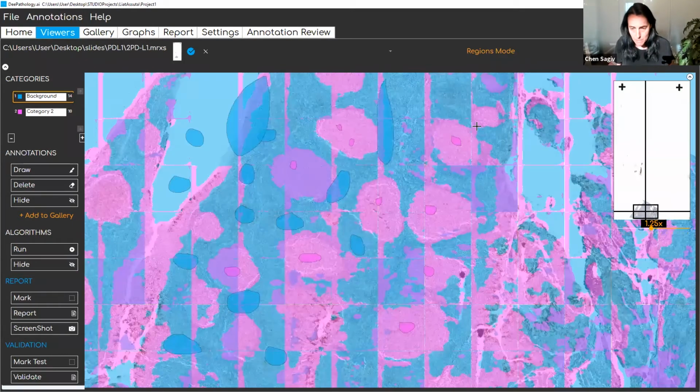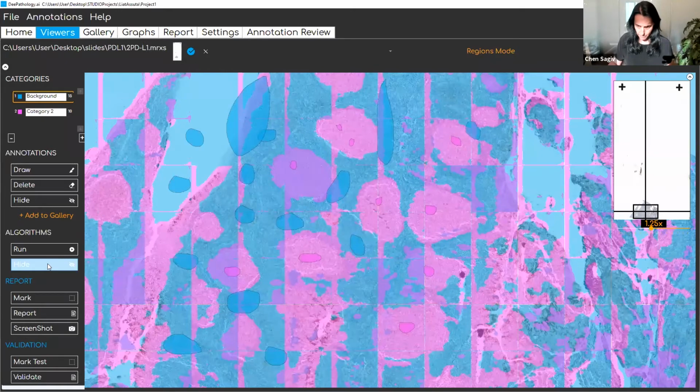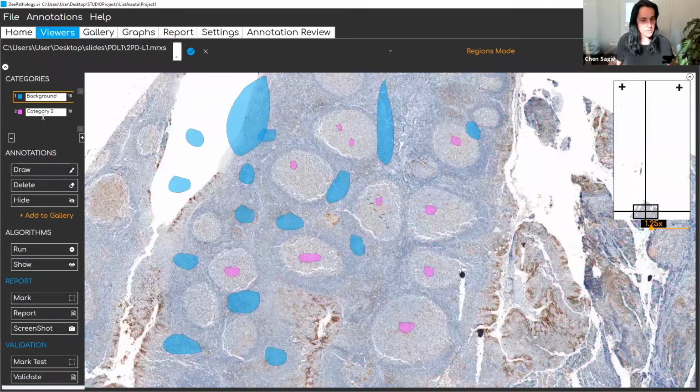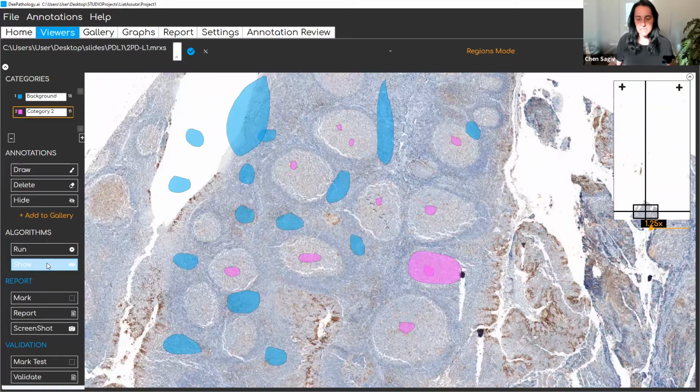Yeah, specifically this area is background. And over here, I just want to be more specific about the foreground, so let's annotate this entire thing just to make sure that the algorithm sees that this is the category I'm looking for. And also right here, let me move again to the background and annotate this as background.